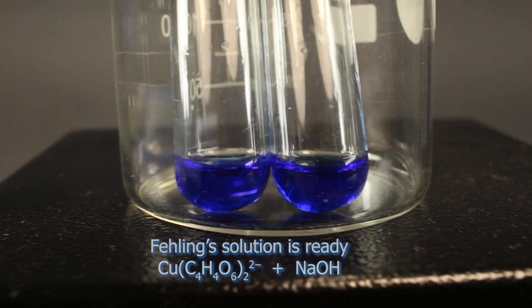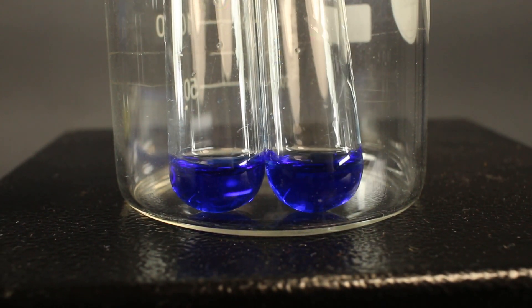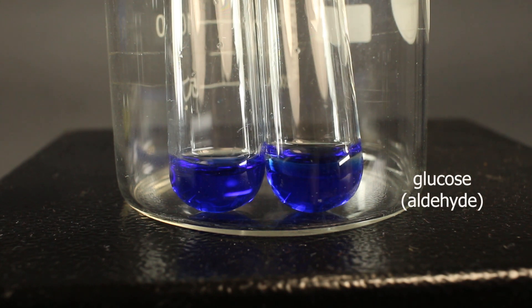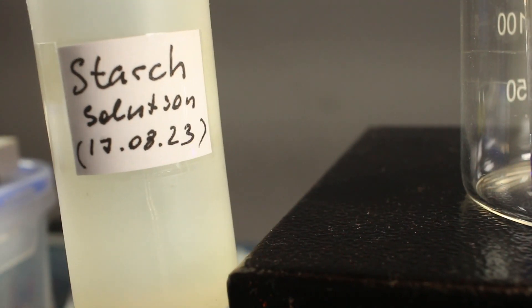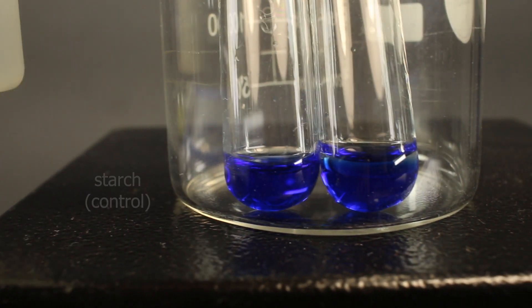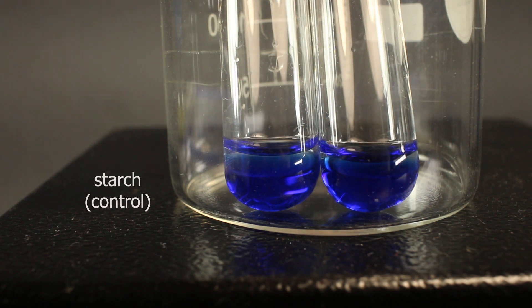Now, Fehling solution is ready, and here are the chemicals which we are going to test. Glucose is an aldehyde, at least it has this conformation in water solution. And starch for control, which is not an aldehyde, because it's polymer of glucose. It cannot open up.